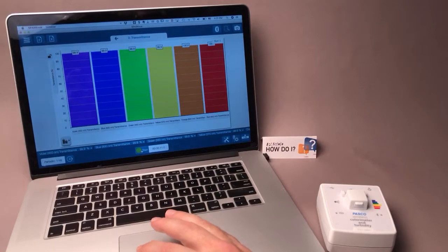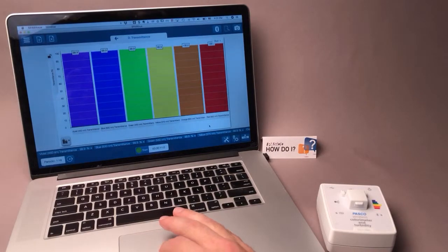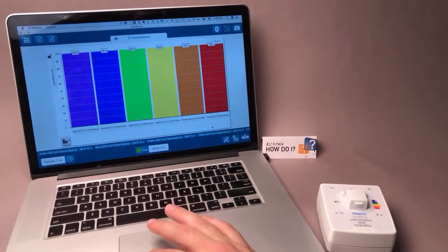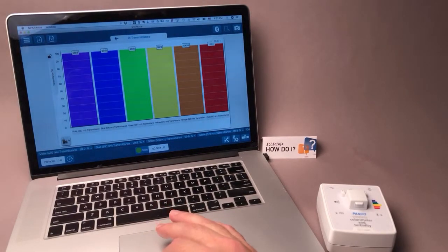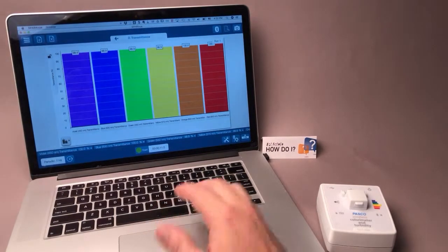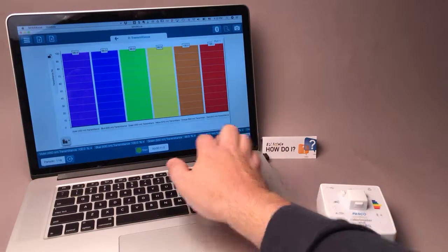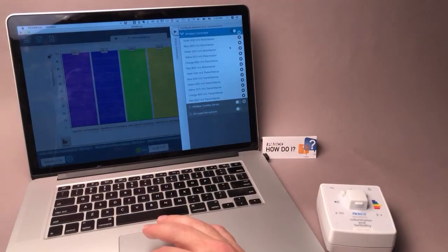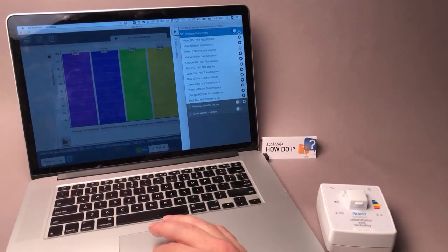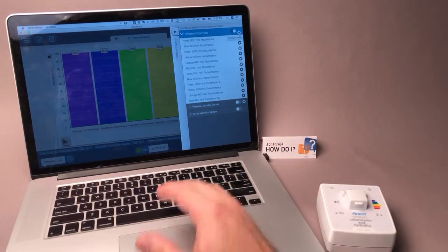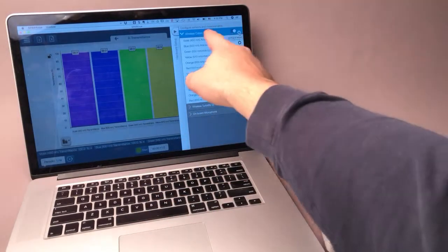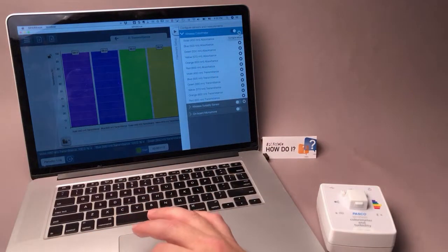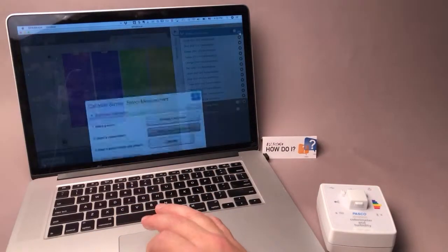Now, if you don't get the dialog for calibration, or you'd simply like to calibrate again, you can go to the Show Hardware Setup button and initiate that same calibration dialog by selecting the gear to the right of Wireless Colorimeter.